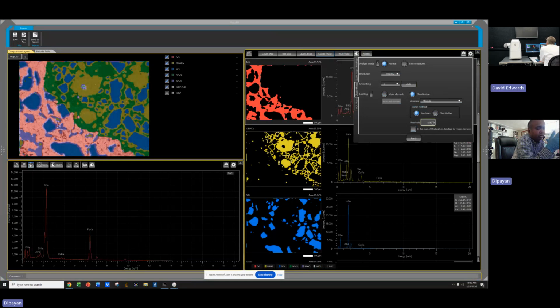In an old concrete where you have a lot of lime leaching, the calcium silica ratio will be very low. So I can't go into one standard paste composition and use that all the time. So I don't know what my threshold will be for paste, which is the main component in a thing. So I have to think about if I want to go for. I can do everything in my database, or I can do only the minerals there, and for my paste, I create a separate database.